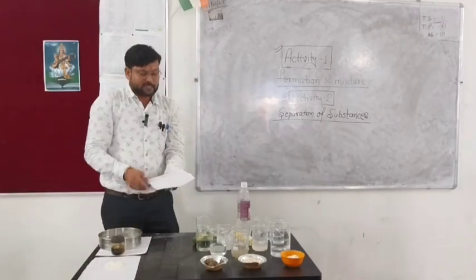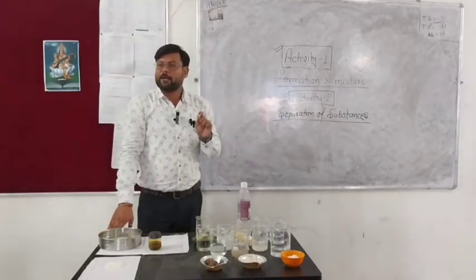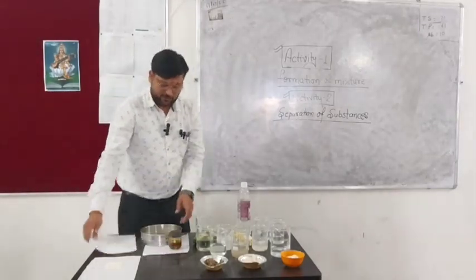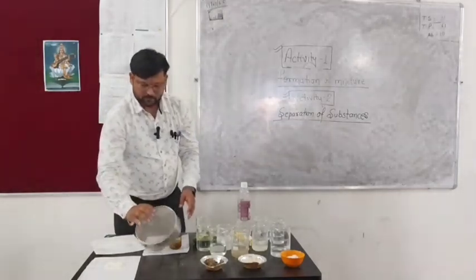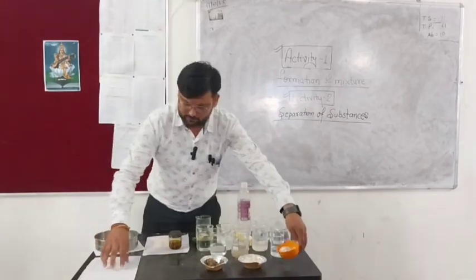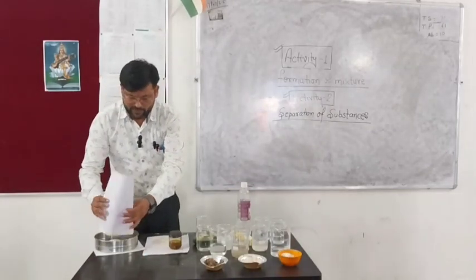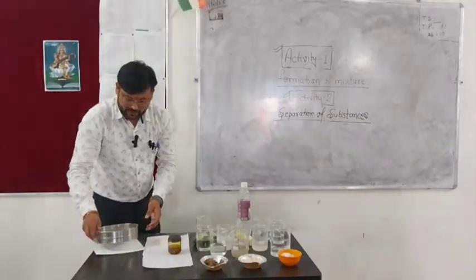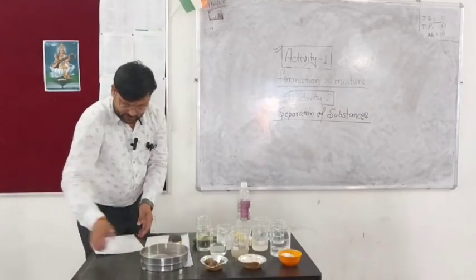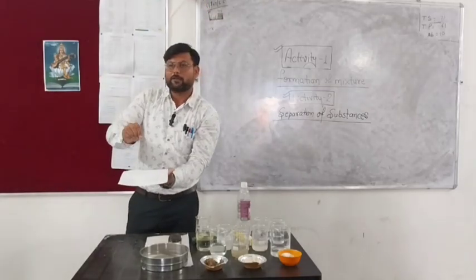If the particle size remains the same, they can't be separated by the sieving process. If the particle sizes differ, they can be separated easily. Now beta, we use this method for another mixture, sugar and salt. When we mix sugar and salt and sieve it, what appears, beta? Salt particles get deposited at the bottom. Now beta, you can see here the salt powder. Clear?